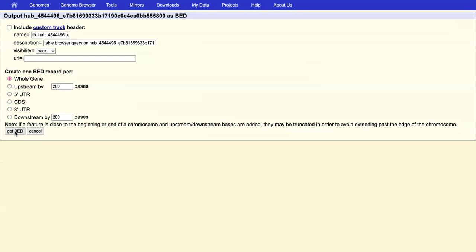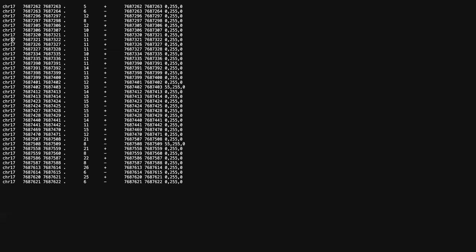Yes, genome. Okay. And then Get BED. Okay. So what you see here, this BED file includes the columns for chromosome, start and end position, methylation signaling, and then what strand it's located on. So the higher signaling values down this middle one corresponds to a higher methylation percentage. And so this process can be repeated with the other cell line and then for RNA-seq analysis.